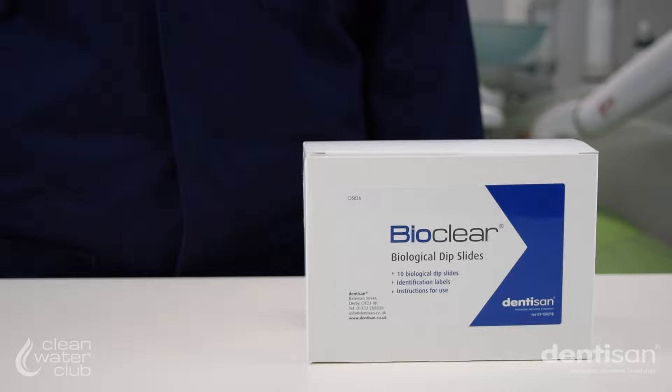Monitoring the water quality in dental unit waterlines can be done easily and efficiently using dip slides, which are used to test both the input and output water in each treatment centre. The input water is the water used to fill the dental unit waterline water bottle. Output water is the water discharged from the line ends of the dental unit waterline.